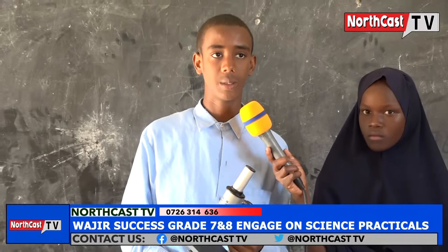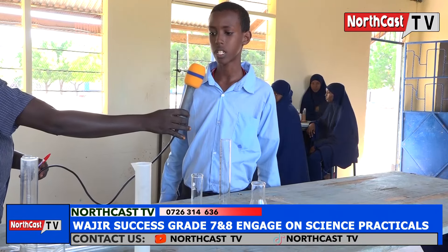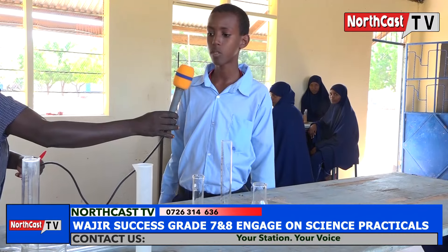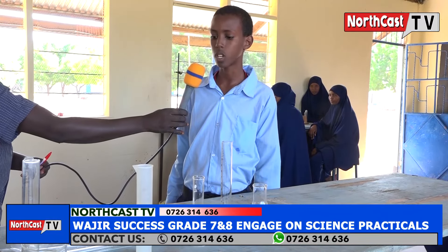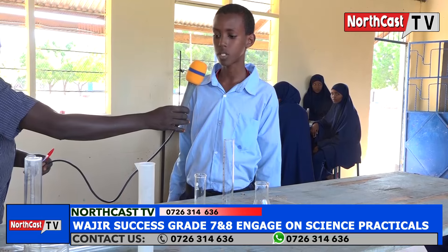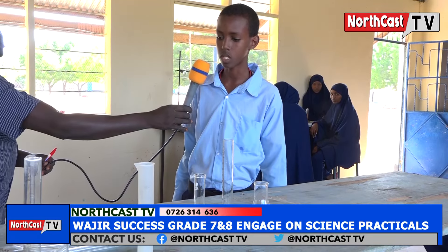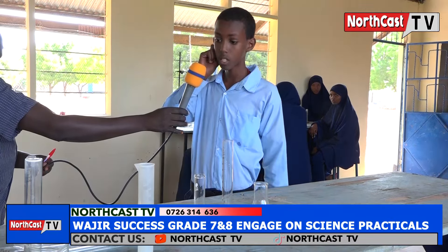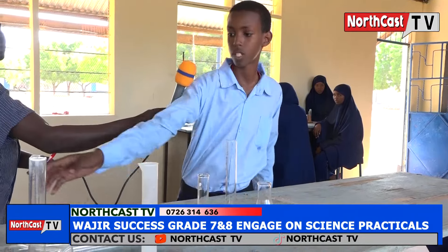Thank you. My name is Sadiq Mohamed, a grade 7 learner at Wajir Success Integrated Academy. I am going to take you through apparatus used for measuring volumes in the laboratory. The apparatus used for measuring volumes in the laboratory are divided into two categories: those that are used for measuring fixed volumes, and those that are used for measuring volumes that are not fixed.